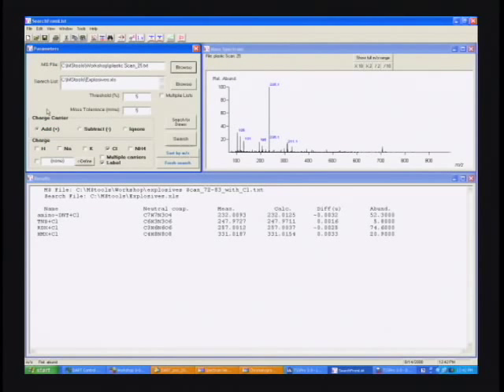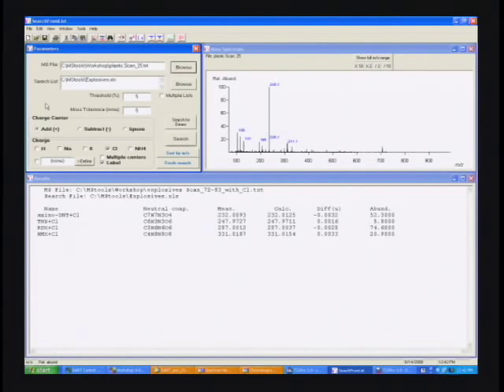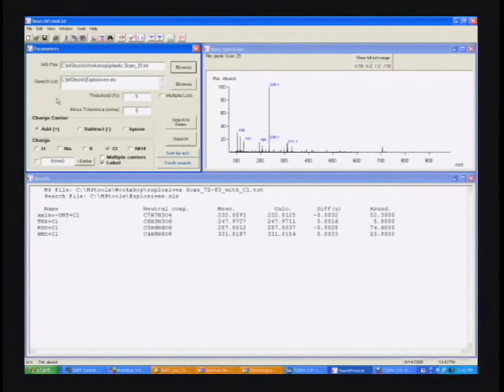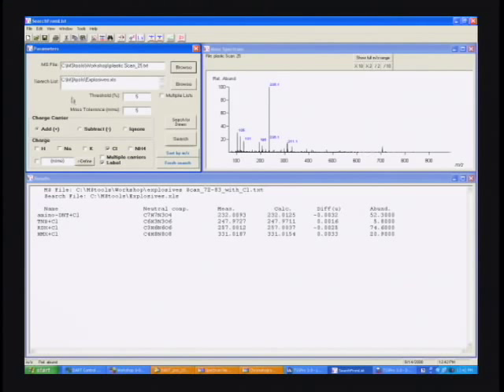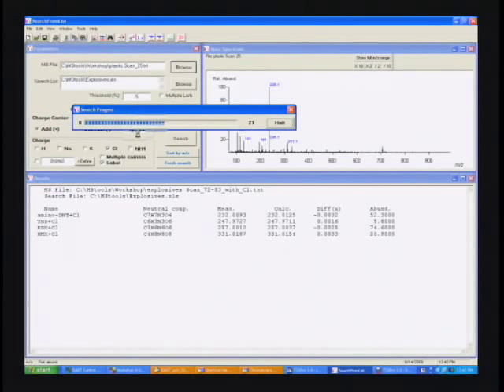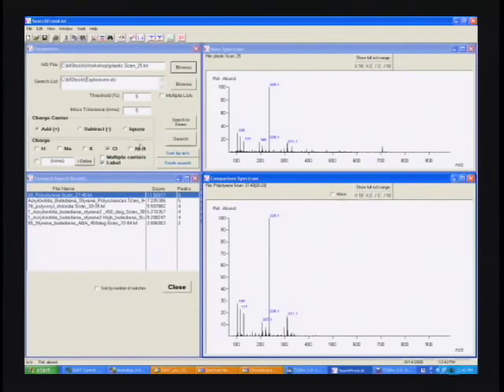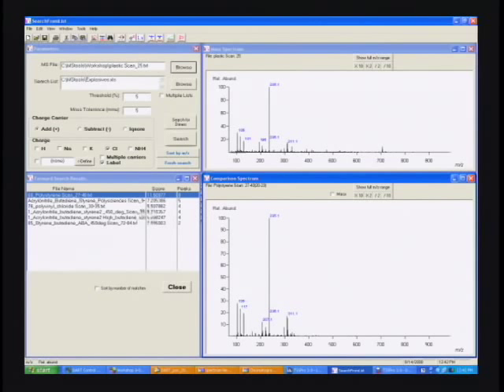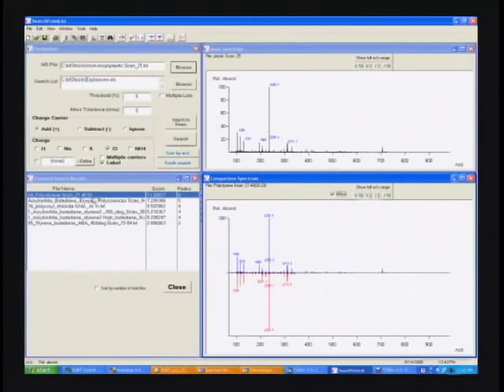And we're going to try to compare this against some polymer mass spectra that we've previously measured for a few different kinds of standard polymers. So I'm not going to try to identify the individual peaks and know what they are. I just want to see what the overall pattern matches, not unlike what Roger was doing with the inks. So to do that, we'll search a little database of polymer samples. And the software just matches this pattern against the exact masses and the intensities of other polymer standards in the library. And if you look, the best match is a polystyrene standard sample.